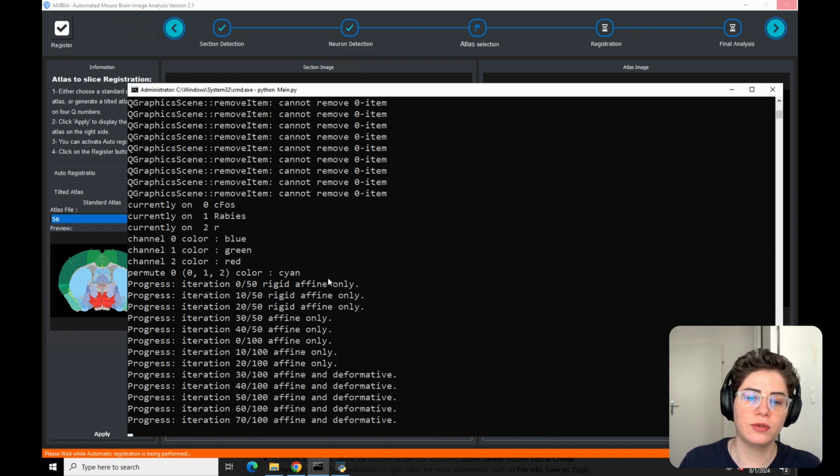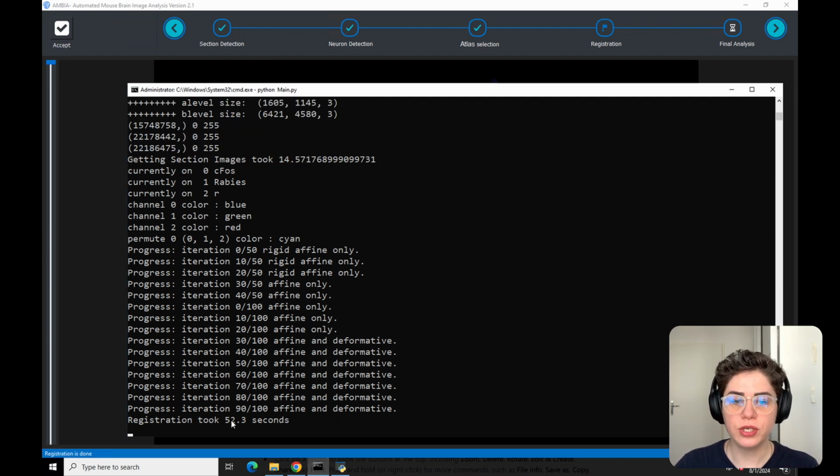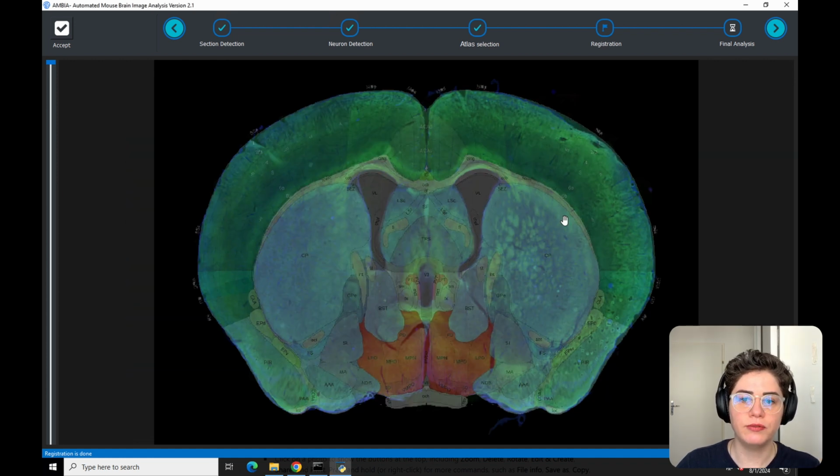I will show you also later what information could be useful for you to keep an eye on. All right, the registration is now done. It took 52 seconds to register this. But as I mentioned, I'm on a virtual Windows machine. It's not as strong, so depending on your system, it can go faster.